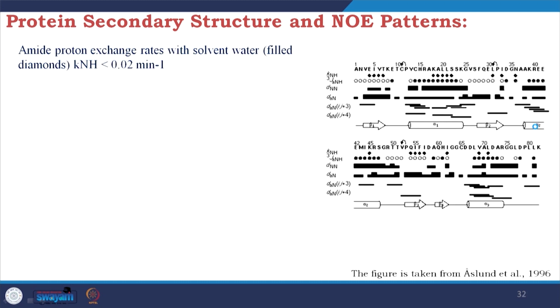So if you look at the secondary structure assignment of this protein, there is amide proton exchange rate with solvent water, which is filled with the diamonds here, these ones.